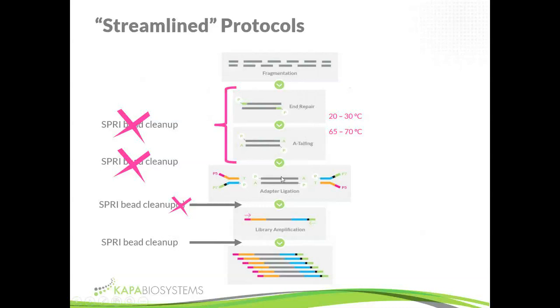Then after ligation, depending on the chemistry, and especially with the HyperPrep kit, we've managed to eliminate one of the SPRI bead cleanups, so that streamlines it even more. In most cases, you don't have to do that. And then everything happens the same from that point onward.